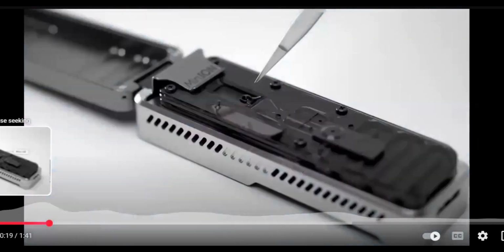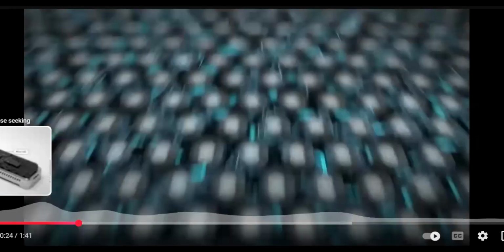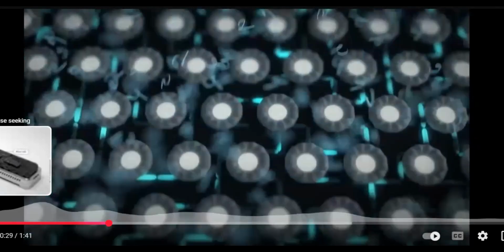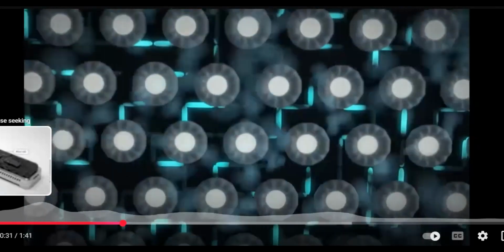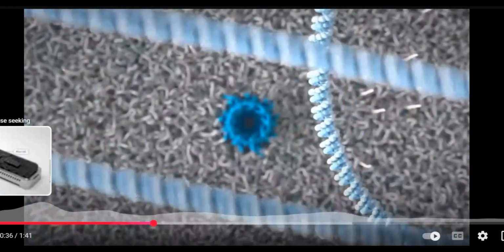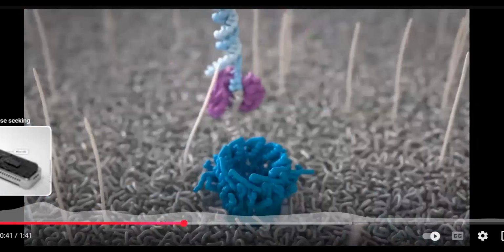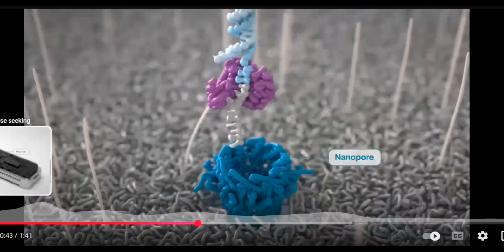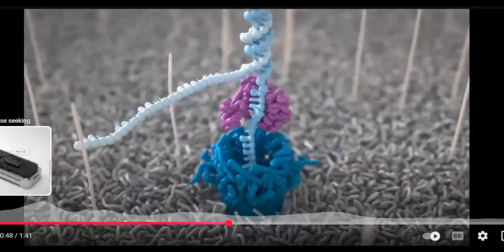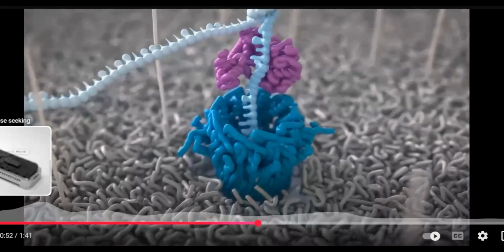DNA, motor protein, and another protein. Is the nanopore. DNA will enter. The tether is used. DNA enters the nanopore. The second strand is removed. DNA is passing through the nanopore.